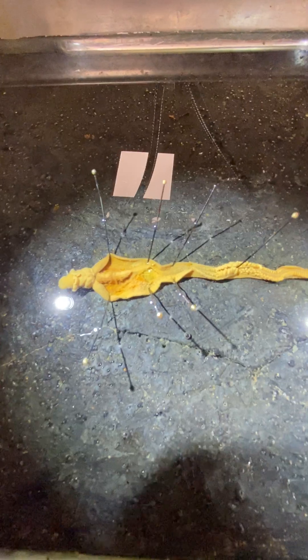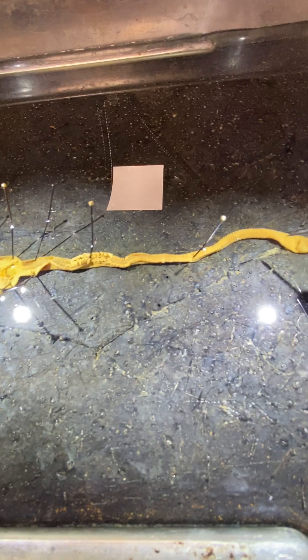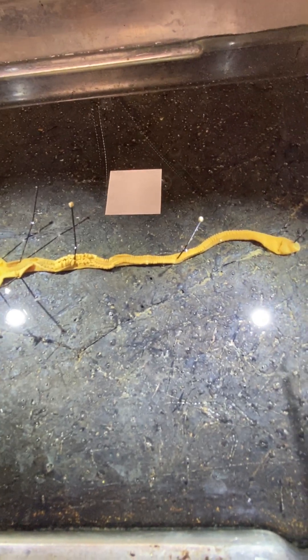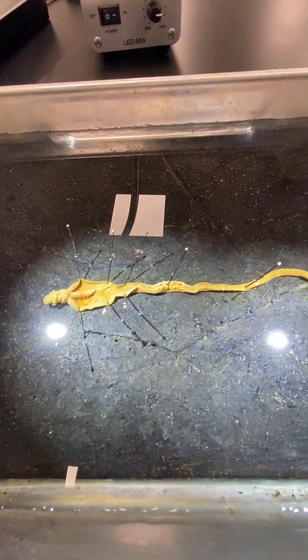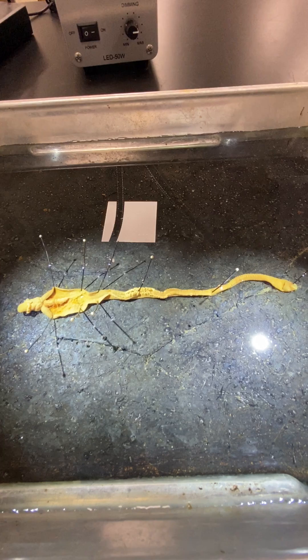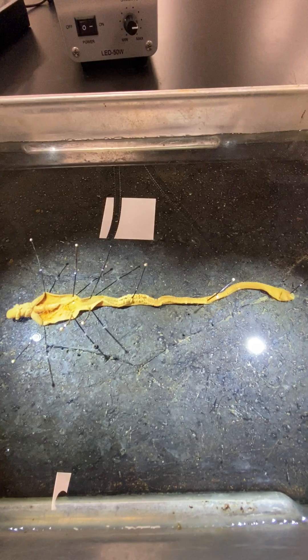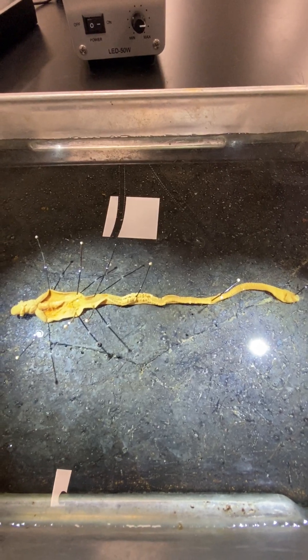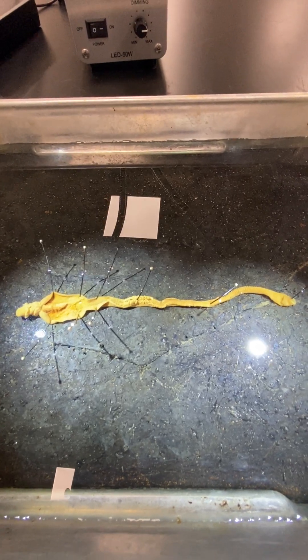When we take a look at the entire worm, we can see proboscis, collar, and trunk, which is divided into three different regions. That is the walkthrough of Balanoglossus, a representative of the acorn worms. This specimen is 15.5 centimeters long, and there's a photograph provided for you to use during your drawings. Of course, you can refer to this video as well.